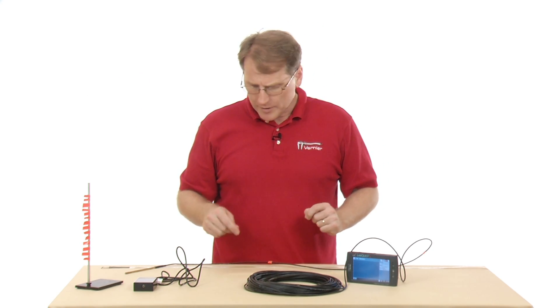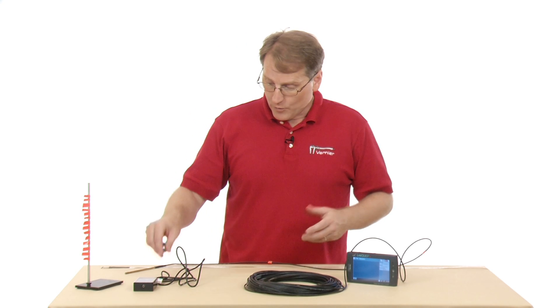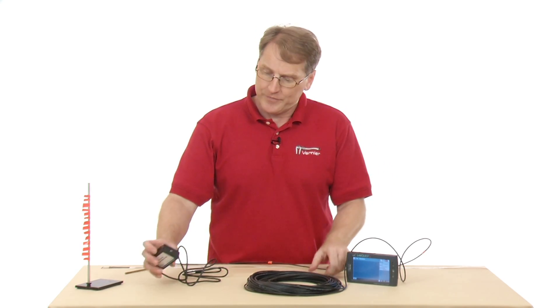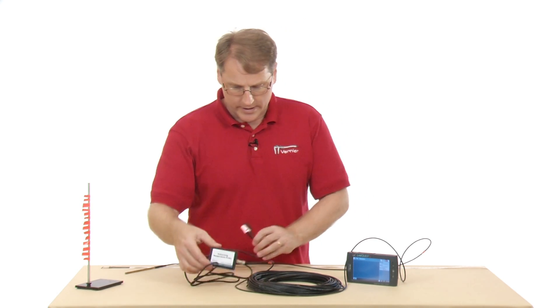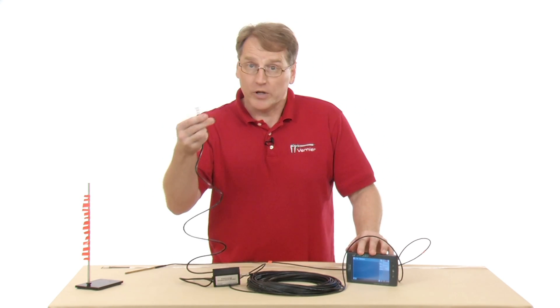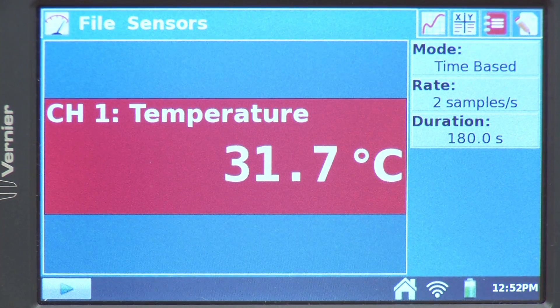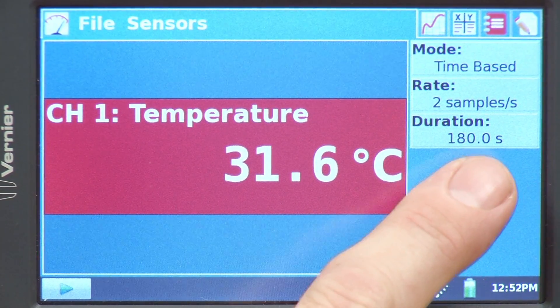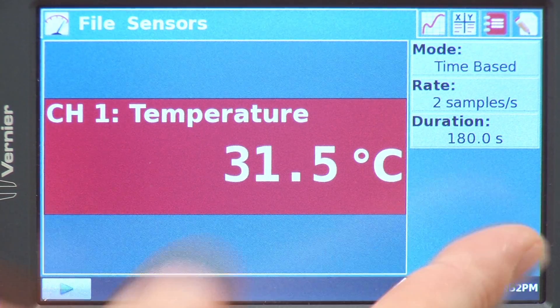Once we get this all measured off, we'll be ready to collect data. I need to have the probe plugged into the sensor end and then plug it into an analog port — I'll plug it into Channel 1. We can see the default settings for the probe on the LabQuest 2: temperature in degrees C, a time-based graph, two samples per second, 180 seconds.